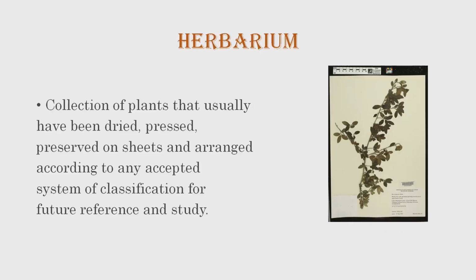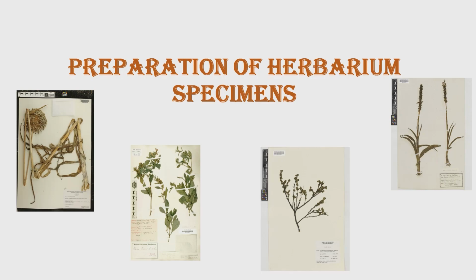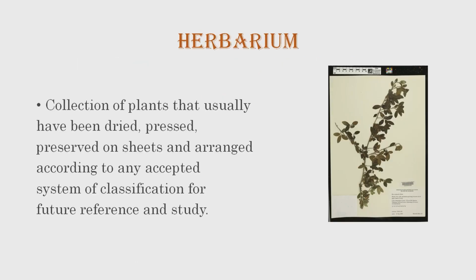Good morning students. Today I am going to teach about preparation of herbarium specimens. So I have just shown some pictures of how a herbarium sheet will look. So what is a herbarium? Why should we go for preparation of herbarium sheets?